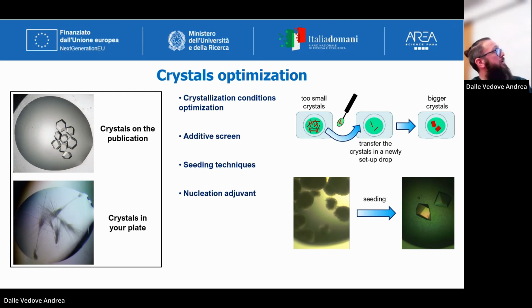What you see is the same protein without seeding, crystallizing in those needle balls that are absolutely useless from the crystallographic point of view, but doing seeding, you end up having those huge crystals that are of amazing quality. This is a very happy, let's say, experiment. Not always do you end up in this situation, but it is a really good indicator of the power of this relatively simple technique.